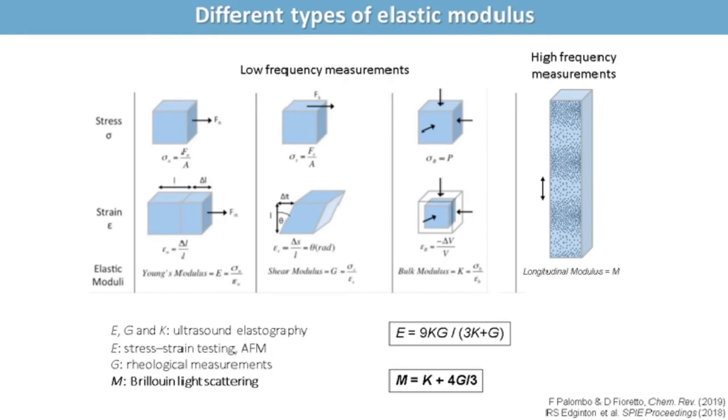The propagation of these compressive waves through the material, if you think of illuminating from above, yields the M that is related to bulk and shear modulus, but to a lower extent, to the point that we expect M to have smaller gradients across the material than Young's modulus has. So values are in the gigapascal range, and the gradients are smaller.